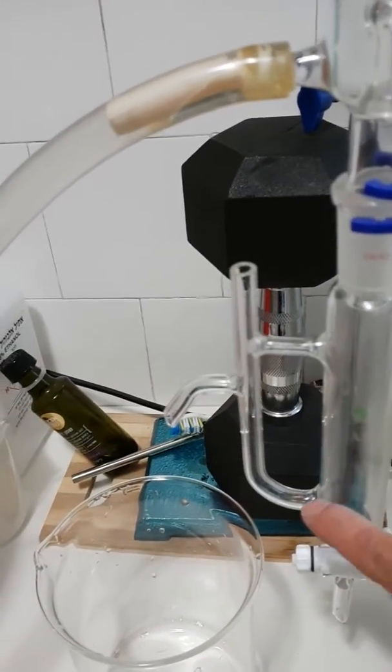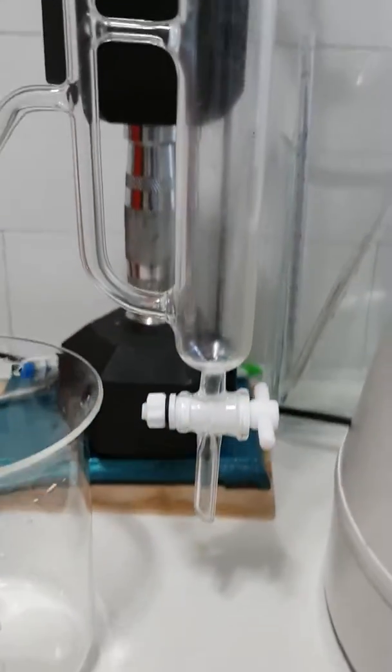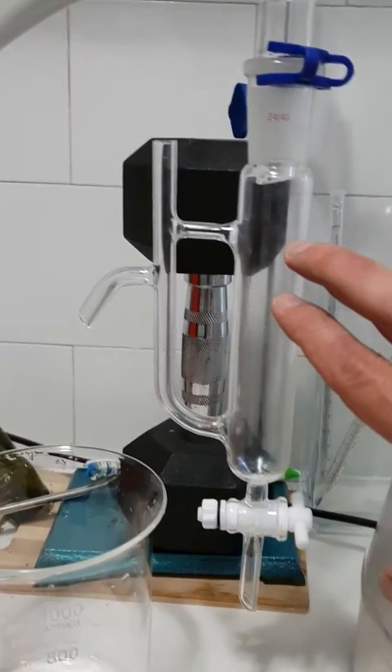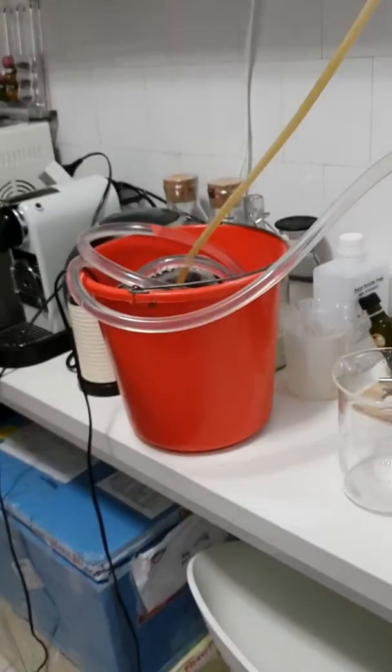Any excess water will stay here and slowly push out of the container flask. In a few hours we will have some water here and a little bit of pine essential oil, and then I'm going to drain it out. Continue later, guys.